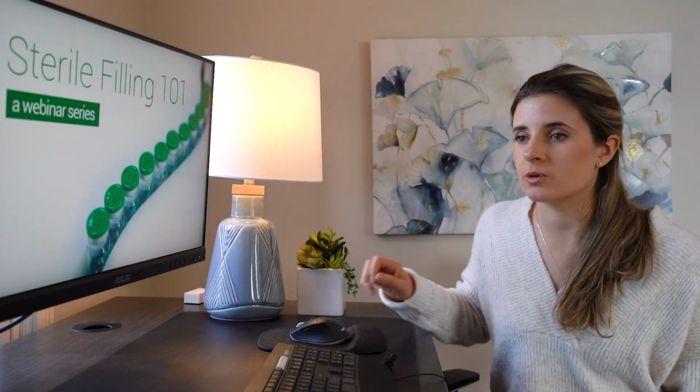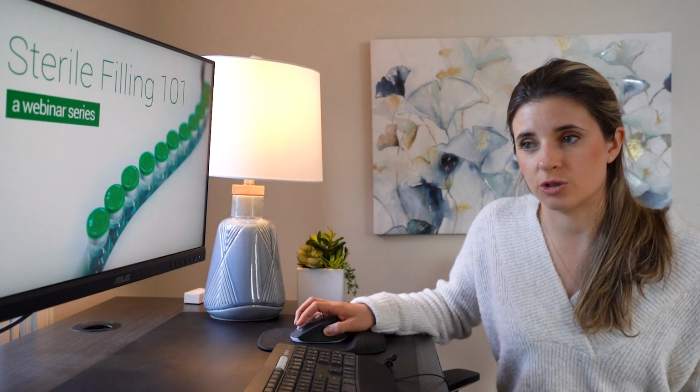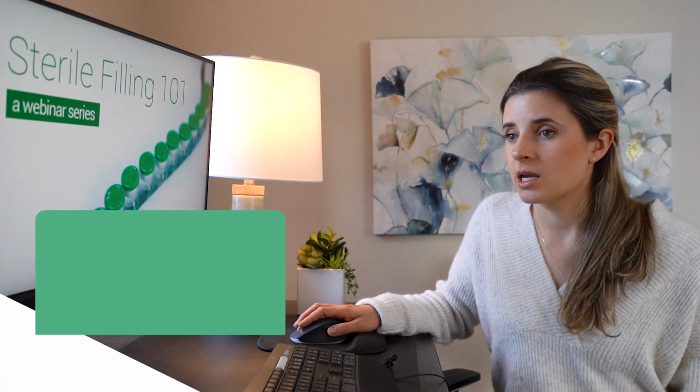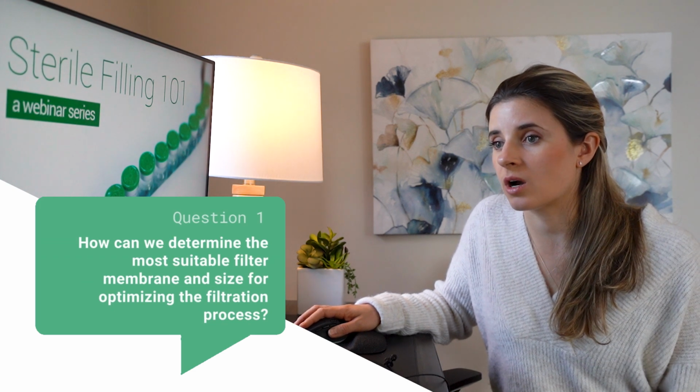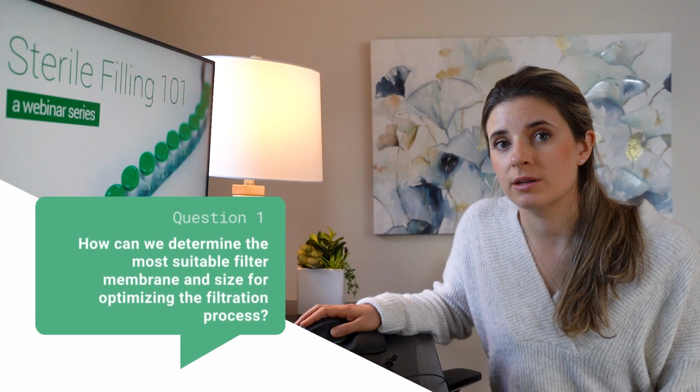Let's start with that first question. I'm going to direct this one to Xu Feng. The question is, how can we determine the most suitable filter membrane and size for optimizing the filtration process? We usually perform a filter study if there's no information on what type of filter membrane or size to use in the process.